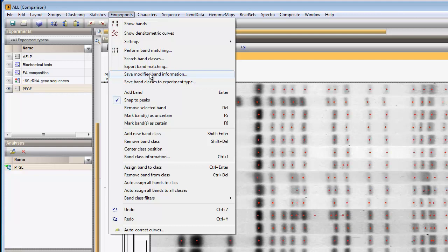If you want to learn more about global band matching of fingerprint patterns, we invite you to view our other demos.